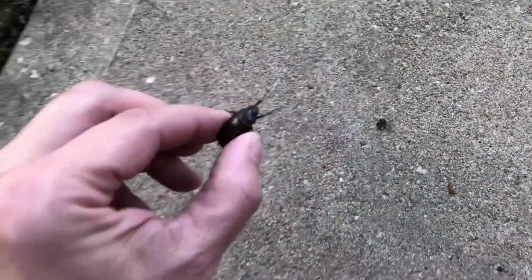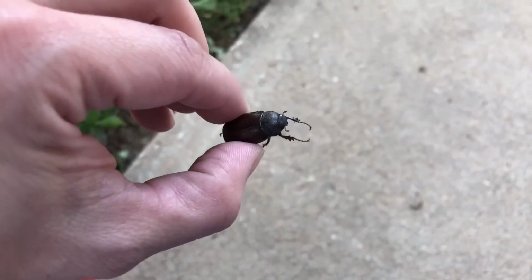In order to collect various arthropods, certain equipment is necessary in order to bait and lure them. There are many methods of collecting arthropods, but the focus here will be manual collection, sweep method, and bait method. For the manual collection, forceps are used to grasp any specimens found, coupled with vials to store them in. A fine paintbrush can also be used to pick up any of the specimens.